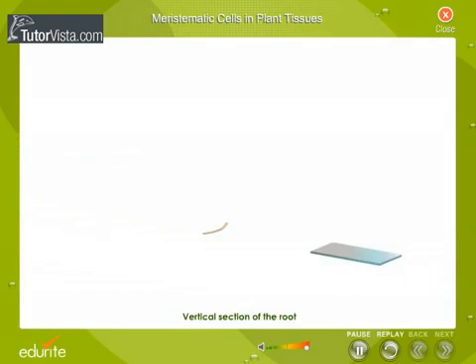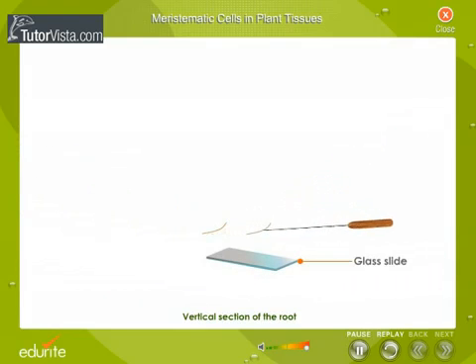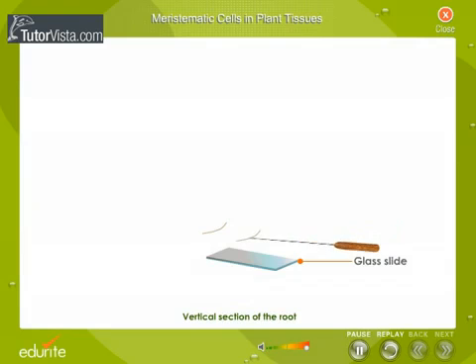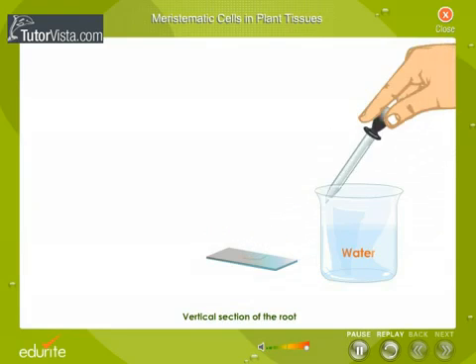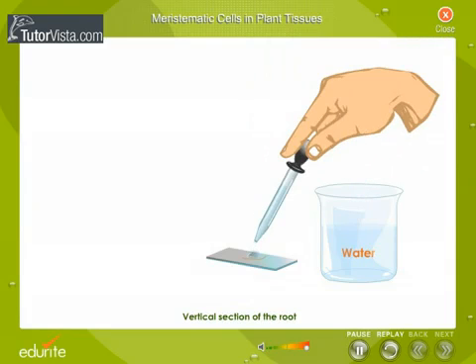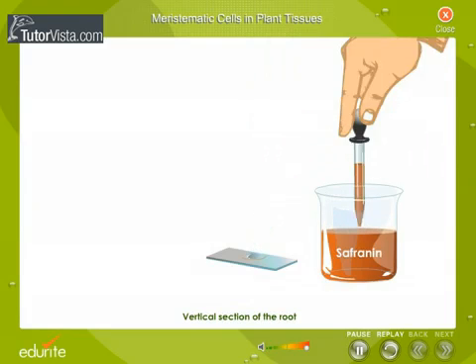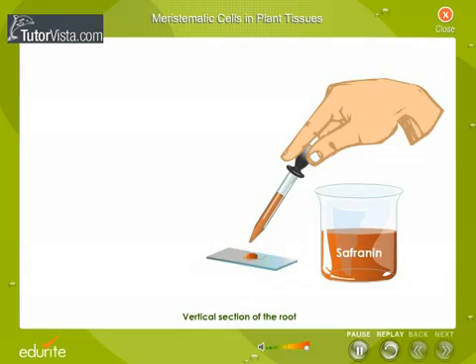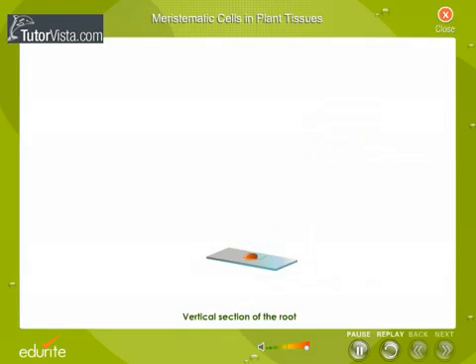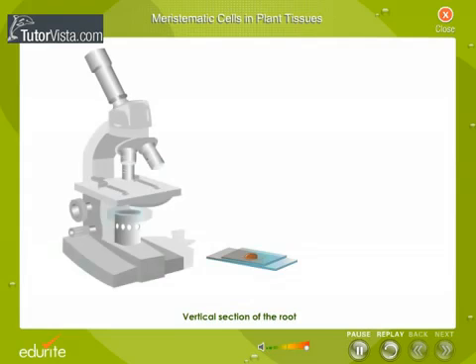Place it on a glass slide, on a drop of water, and add a drop of safranin. Place a cover slip and observe the section of the root tip under a microscope.